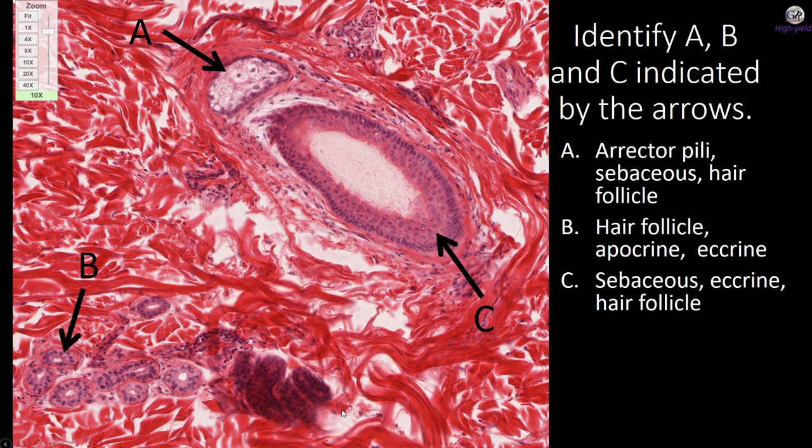So what do I have? I have a lot of fibers. So we're probably in the dermis, big fibers, maybe reticular layer. I've got glands. So these are little lumens, little cuboidal cells. These look like eccrine sweat glands, secretory portion, the dark duct portions here. Over here, I have a big fluffy gland, and I can see products in these cells, so they're making something, and they're big fluffy cloud-like. I'm going to go with sebaceous gland for this thing.